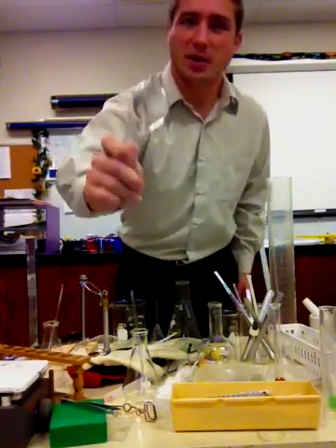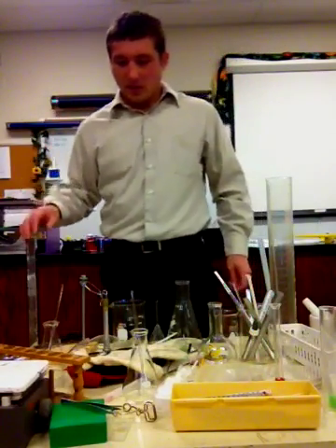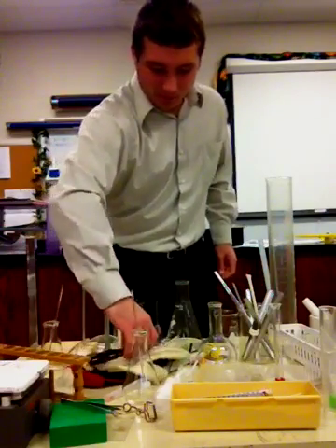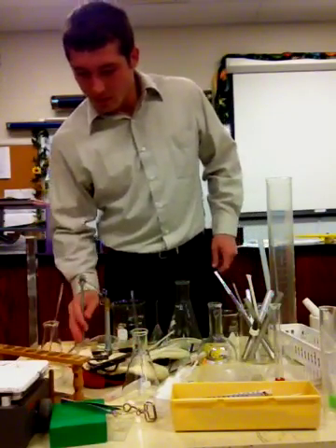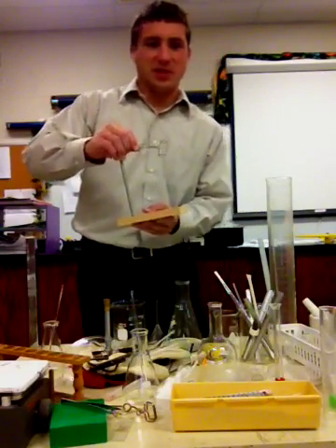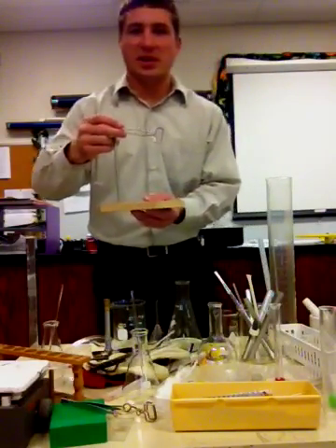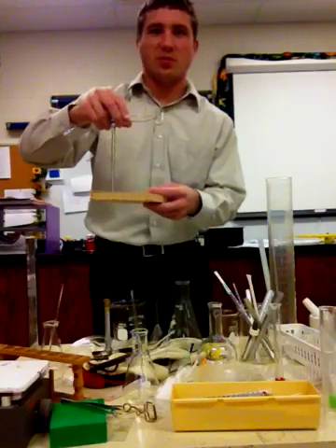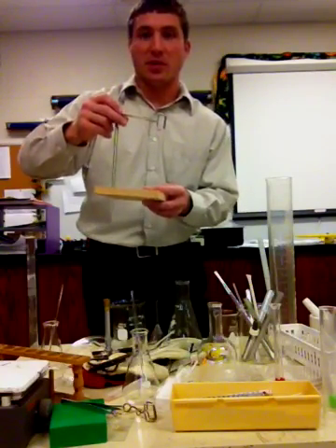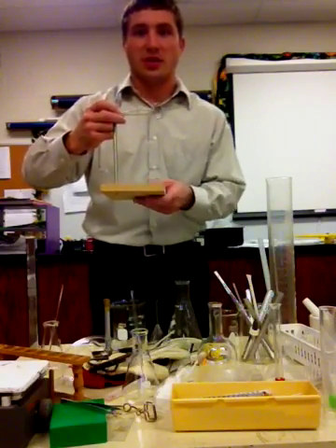This is known as a simple microscope, and of course we also have a compound microscope. This trusty device is known as a ring stand — not a test tube rack. We can use it to hold a test tube, perhaps over a Bunsen burner if we lift it up a little bit higher, or over some other type of object that we need to hold it over.